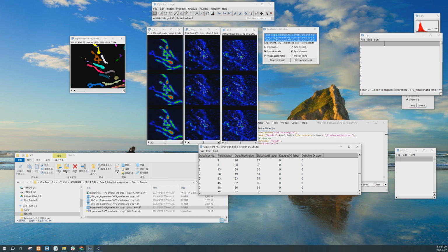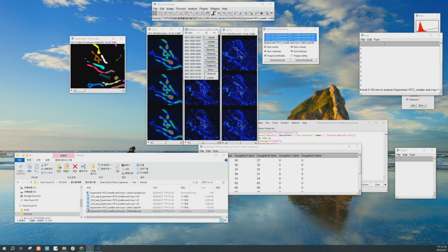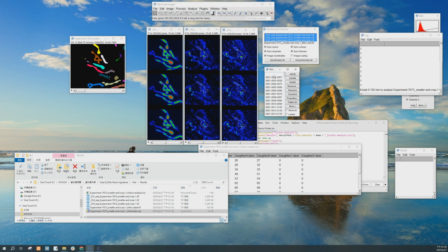If you also want to know their actual locations, the ROI list is saved together with results as well. So here, you can find out which mitochondrion this ROI list corresponds to. You can see this yellow line here. Okay, this is the macro we're using. The introduction to the macro, mitochondria fission finder.